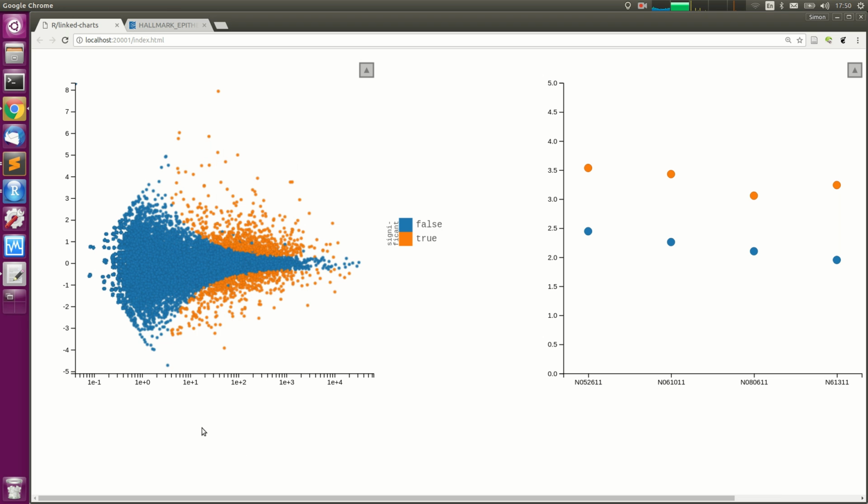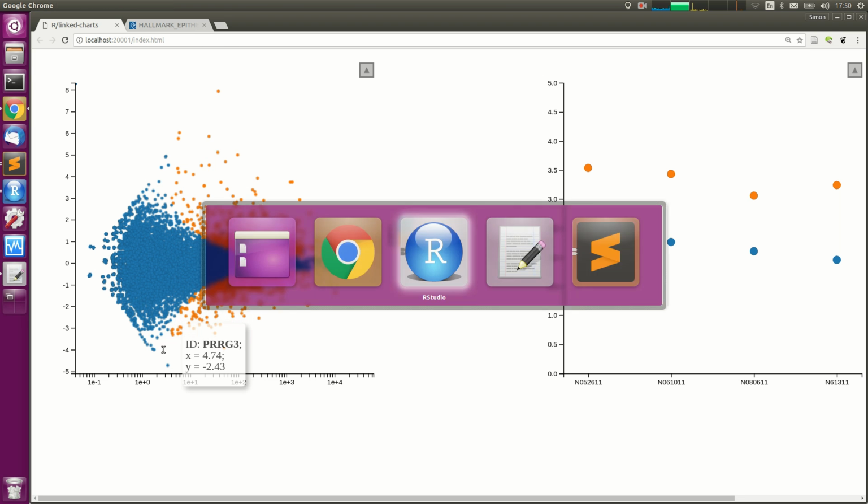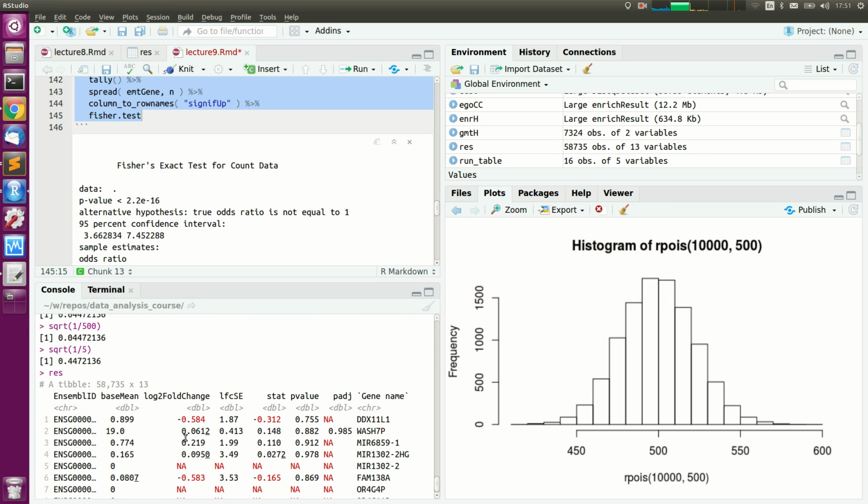Who knows? It might be that we are just running into this imprecision, which means if we now want to know which genes really respond strongly to dexamethasone, it might well be that these small genes here have a much stronger response than these genes. And if we repeated this experiment, we would see in the repeat that this gene suddenly sits down there, while these genes stay as they are. To see this, we would simply calculate the standard error of this gene. You might have noticed that the results column actually has this information. Each fold change here has a standard error, and sometimes it's quite big. Here, for example, the standard error is larger than the fold change, which is why it doesn't have a significant p-value.